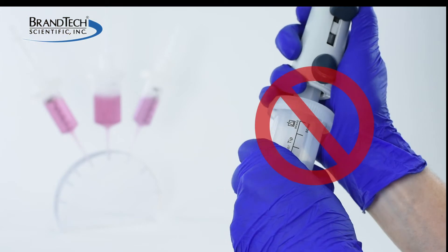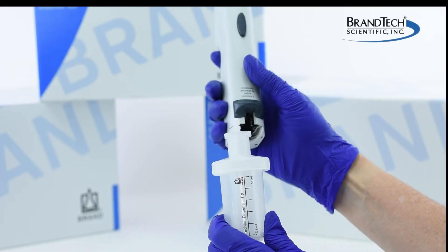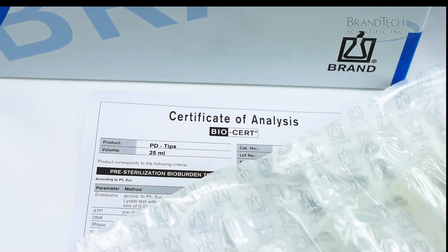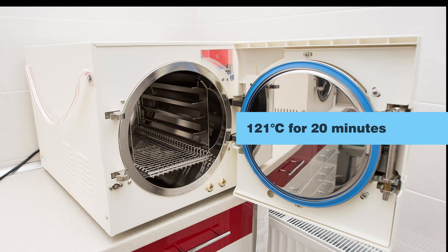Never try to separate the adapter from the tip while installed in the pipette. The tip and the adapter must be removed as a single unit. Note that while PD tips themselves cannot be autoclaved and must be purchased as sterile, the adapters can be cleaned and autoclaved at 121 degrees Celsius for 20 minutes.